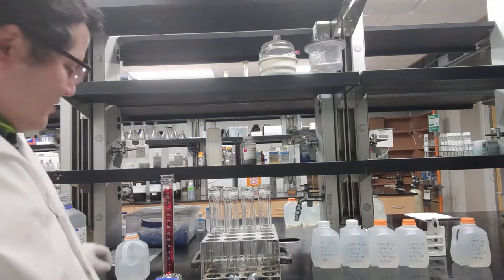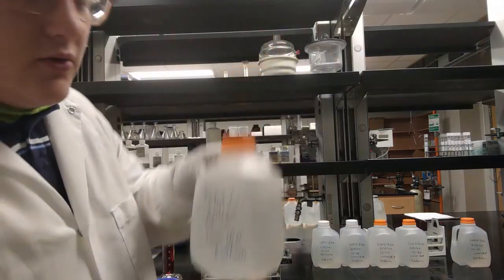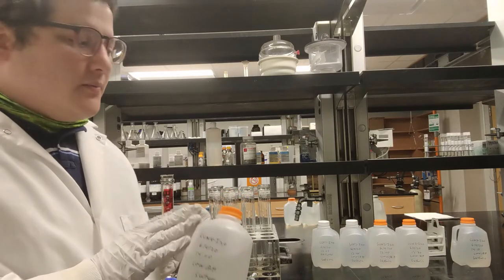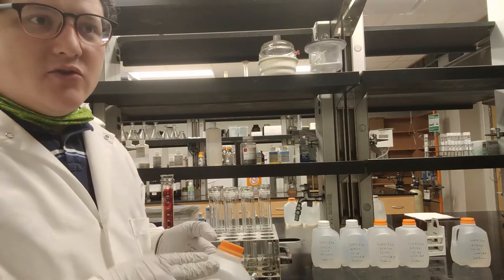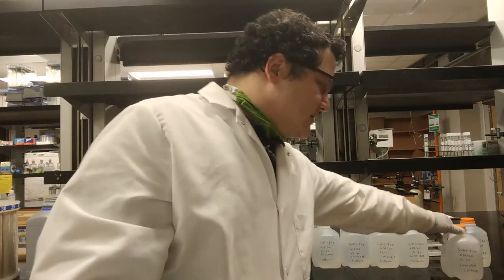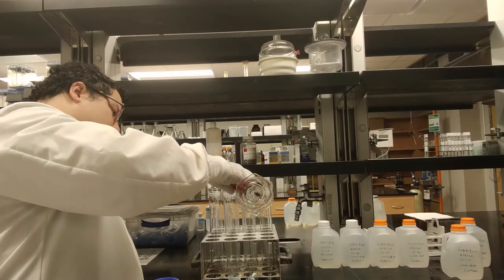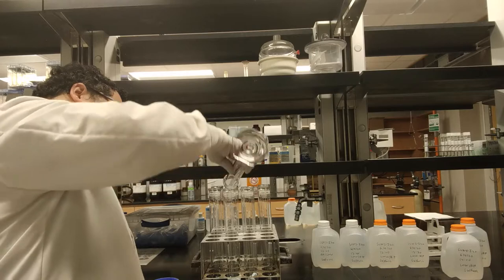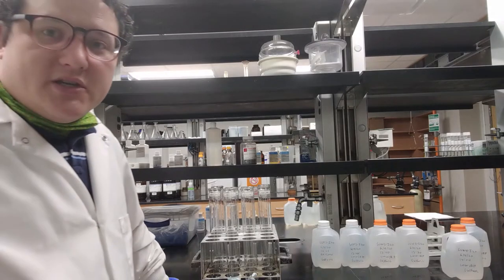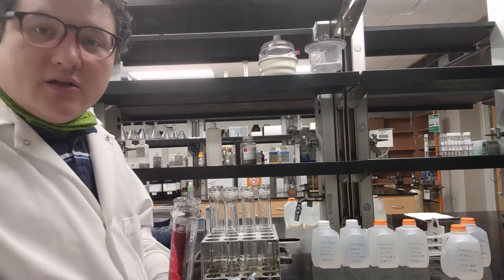One crucial thing about these samples is that they are treated with sulfuric acid. What that's going to do is trap any ammonia in the solution. But it's not nitric acid, because if it were nitric acid, then you would be adding nitrogen to the solution and you wouldn't be getting an accurate result for your total nitrogen analysis. You can see it comes up pretty close to the top, which is why we need those boiling chips to make sure it doesn't boil over. I'm going to rinse this with deionized water and then do the rest.